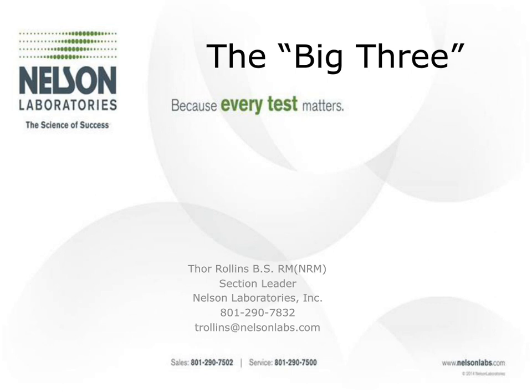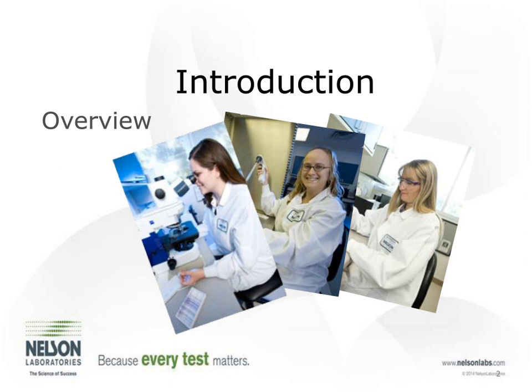Thanks, Shayna. I'm really excited for this webinar today. I'm not saying that the other webinars weren't also a great thing to do, but usually we're talking about regulatory issues or testing that we have been doing for decades, and we're just reinforcing some of the new concepts in those tests. But today we're actually going to be talking about the new big three, which is still cytotox, sensitization, and irritation. But we're going to be talking about how those three tests, specifically the two tests, sensitization and irritation, may be changing in the near future.